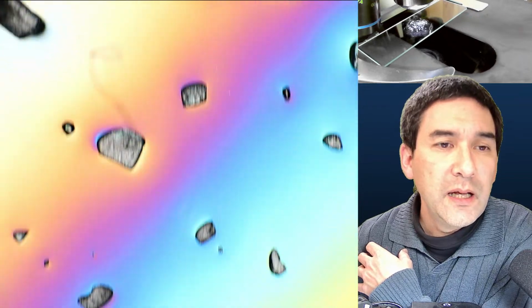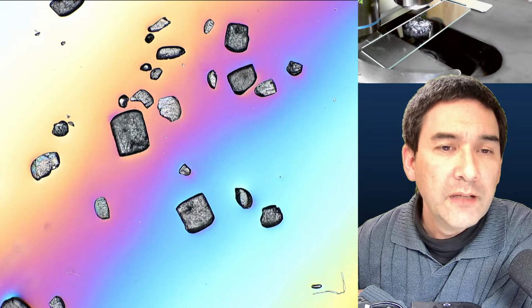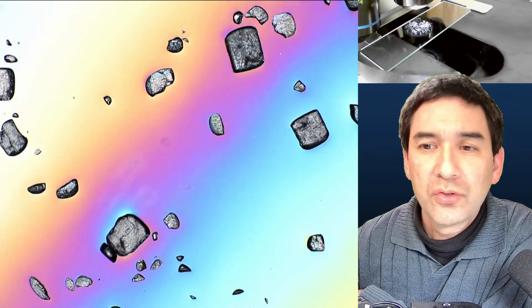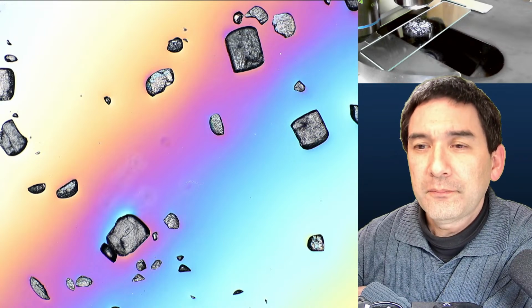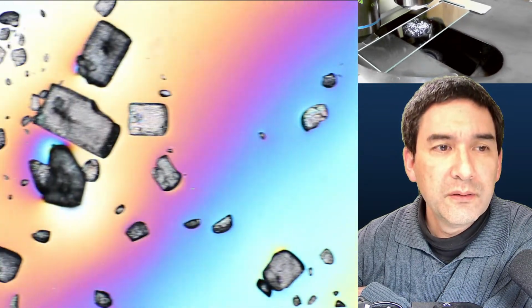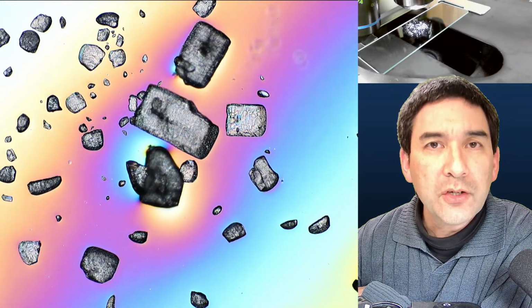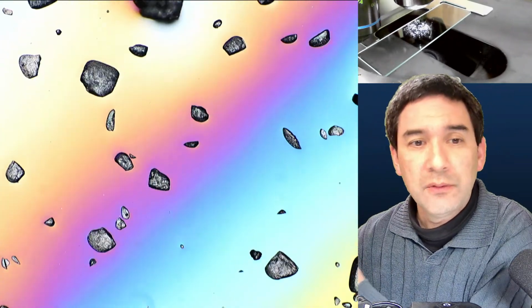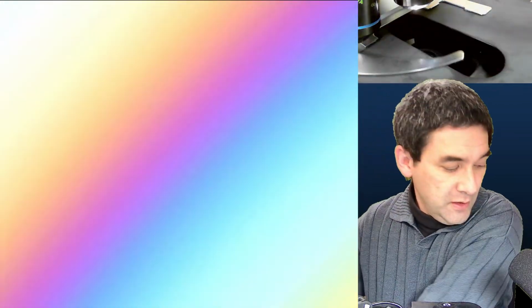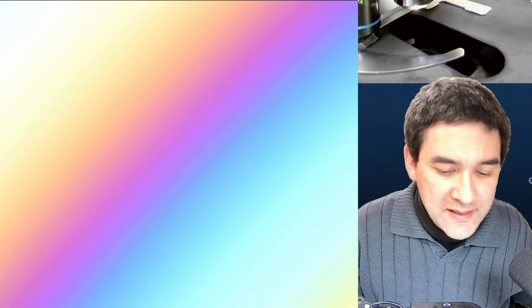You can also see that many of these crystals are not quite as sharp anymore, and for this reason, it is a sign that they started to dissolve a little bit. So this is basically the substance here. And now, how does vitamin C look when you actually allow the water to completely evaporate? This is something that I would also like to show you now, but I'm going to put this a little bit to the side first, and I'm going to label this. So citric acid, no, it's not citric acid, ascorbic acid, that's vitamin C, is number 2.